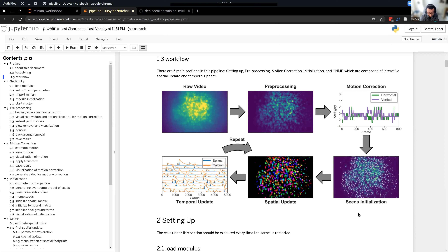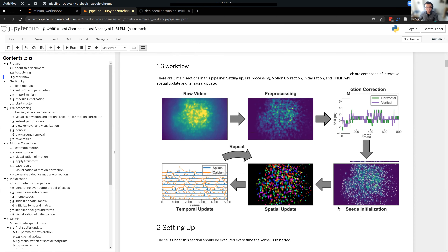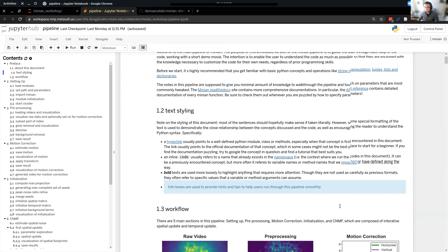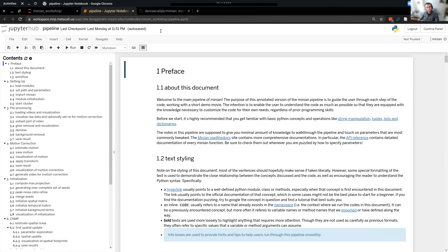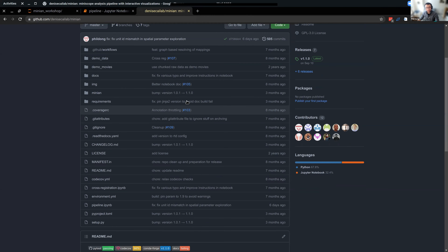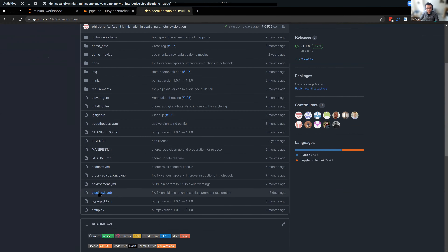I think we're ready to get started. Does anyone have their notebook open — the notebook and the table of contents on the left side visible? This notebook is almost identical to the one you can get from GitHub. I'm going to switch to the GitHub tab. This is the Minion GitHub repo online, and the notebook we're using today is almost identical to this pipeline notebook here.